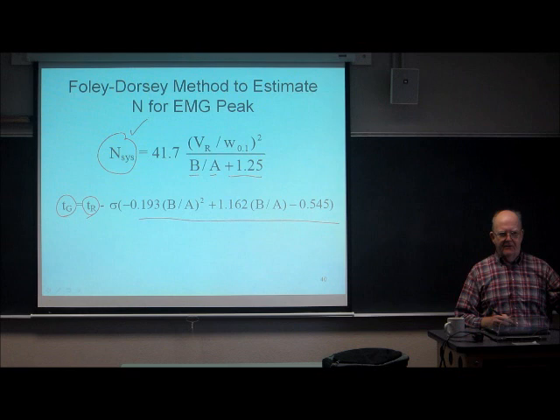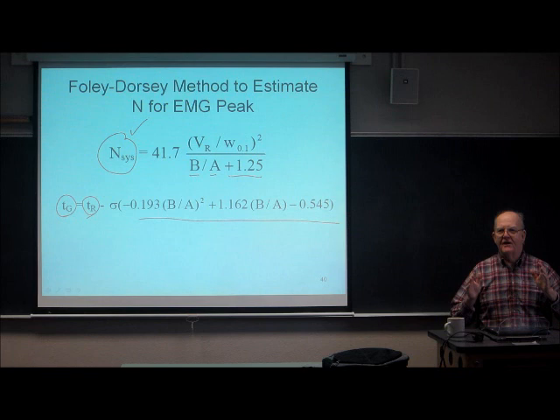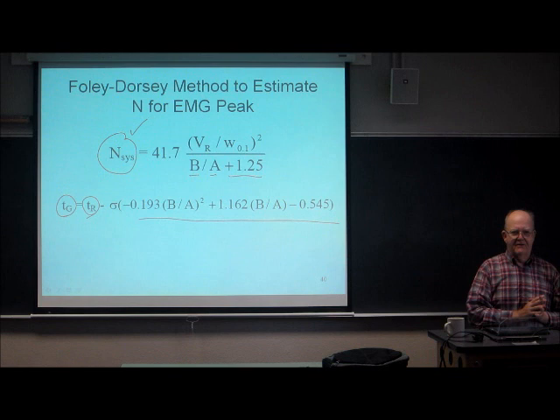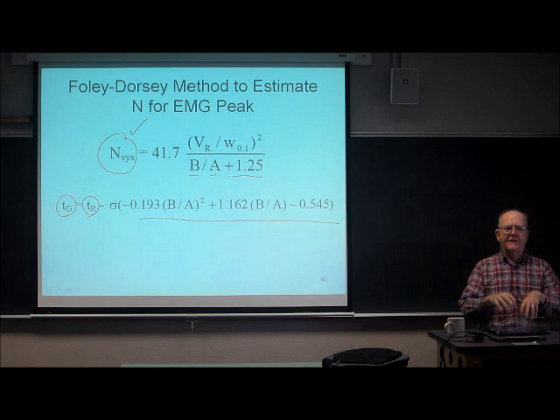If you don't override the algorithms, it's going to measure the half width of the peak, pop that into the Gaussian formula that I just showed you on the previous slide, and you're going to get a plate count. And it's going to be wrong. However, I also don't know of any data systems that you cannot override the default algorithm and tell it how, and it'll give you a number of options as to how it would evaluate the true plate count. One of them could well be to assume that it's an exponentially modified Gaussian, and then it's going to implement something like what I just told you about.